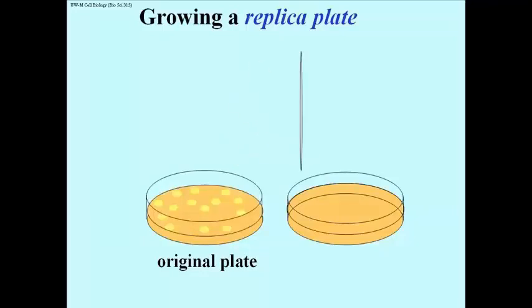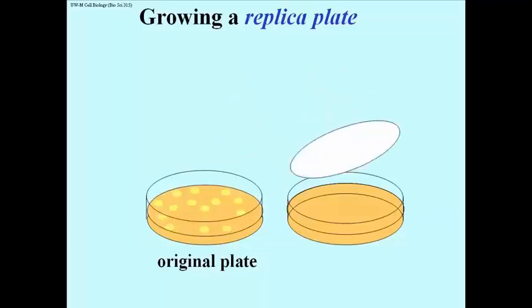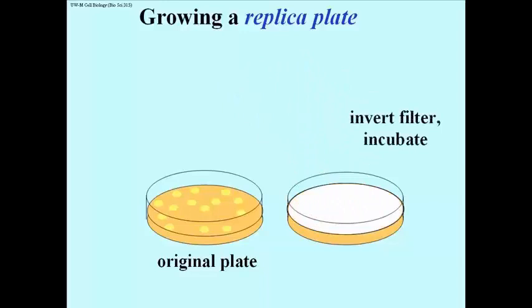Then you take that filter, turn it right side up — colony side up — and put it on a fresh plate. Over time, growth in that dish will produce a mirror image of the colonies that were on the original plate. That's the replica plate.